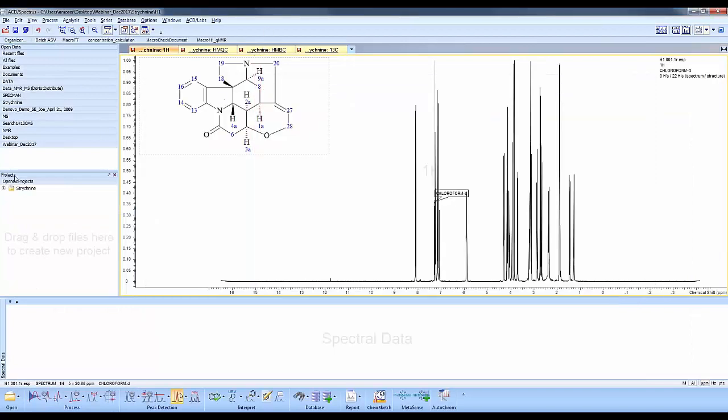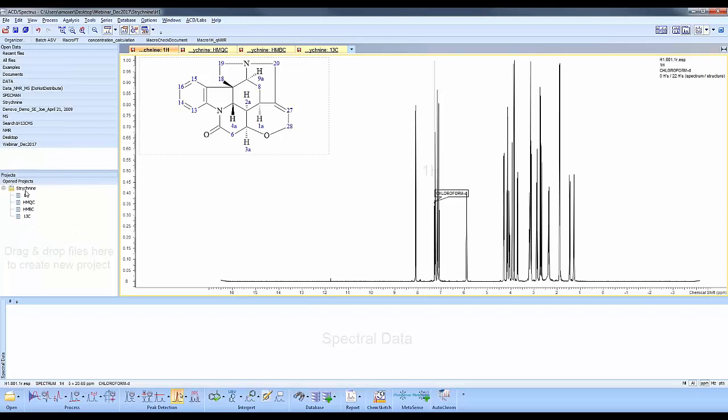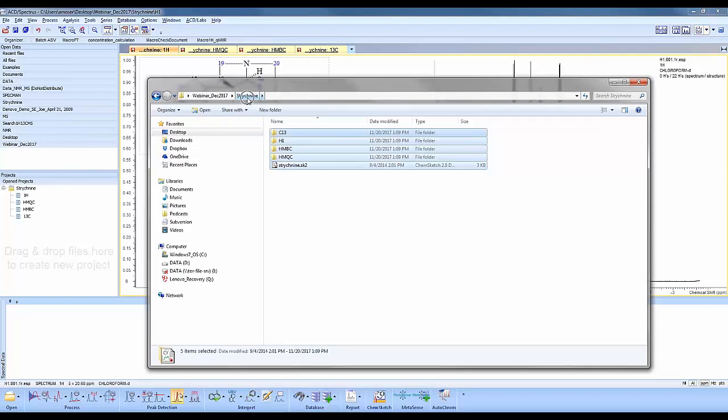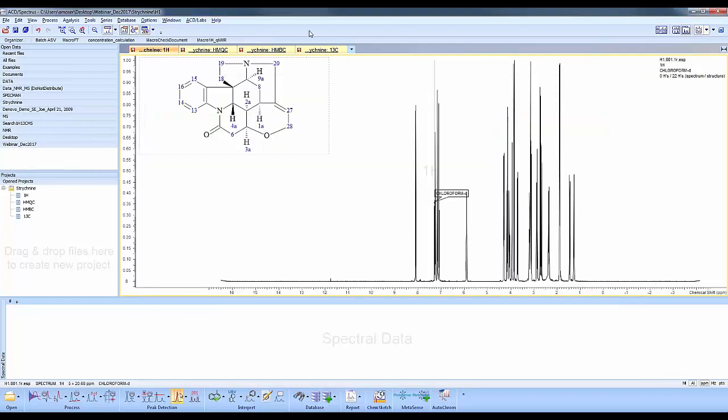Let's have a look. We have our structure. By the way, the name of the folder comes from the top-level folder name, so that's done automatically. You don't have to rename it if you want to save some time there.